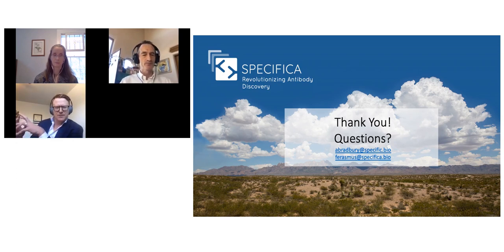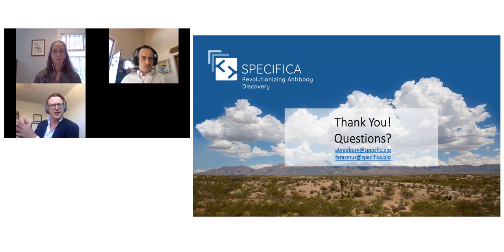Yeah, absolutely. In addition to the 100, you can also pre-select the max number of representatives you'd want across that cluster space. So you may want to have representatives of up to 5, or you want to do it according to their distribution. Those options are available, or you can be more uniform. And we're approaching this from a uniform perspective, where we try to broaden our scope by selecting uniformly across those populations of interest.